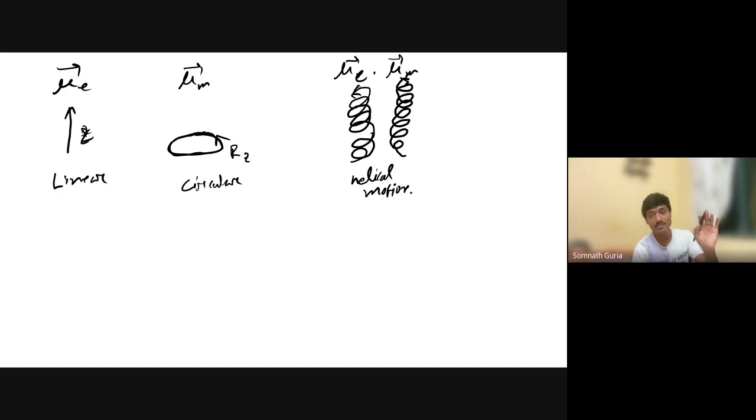So the properties of those systems will behave in a different way. That's why we'll be able to differentiate: this is enantiomer A, this is enantiomer B, and we can detect the molecules.